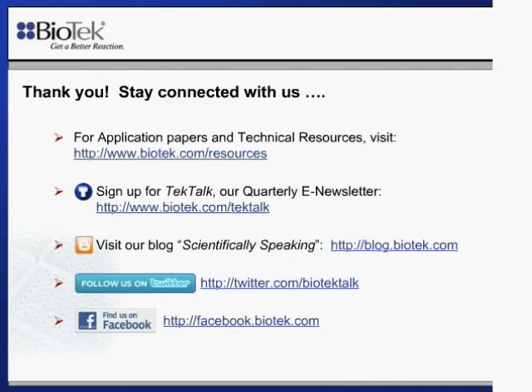I've got several questions here, so let me pick one. The first question is: is this microvolume analysis conducted with a fluorescent dye, or is it simply the OD absorbance?